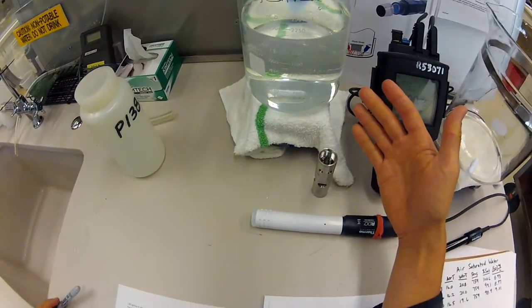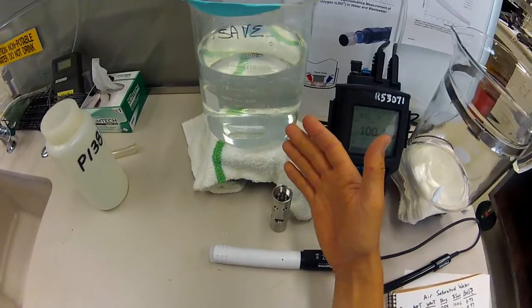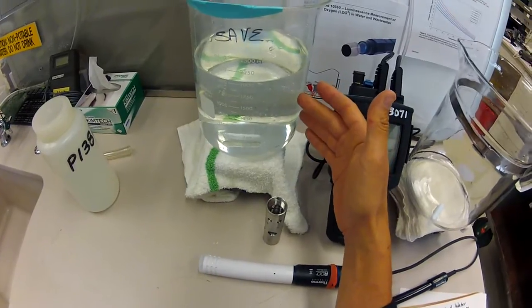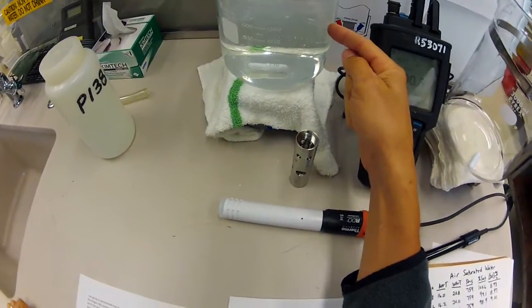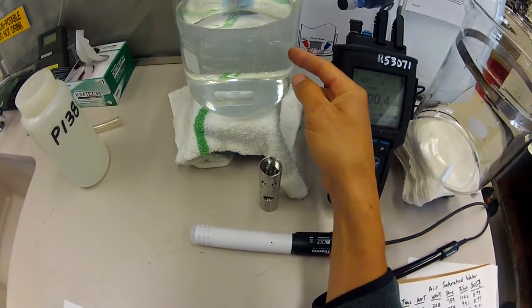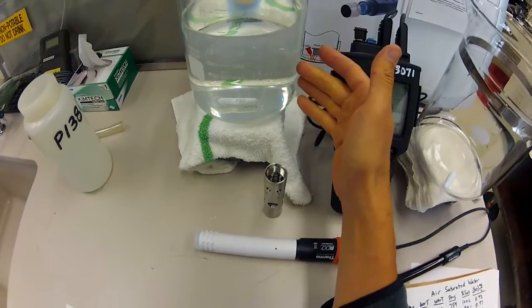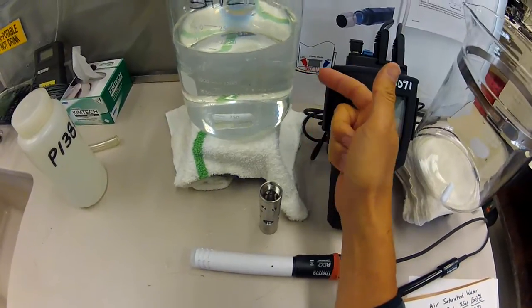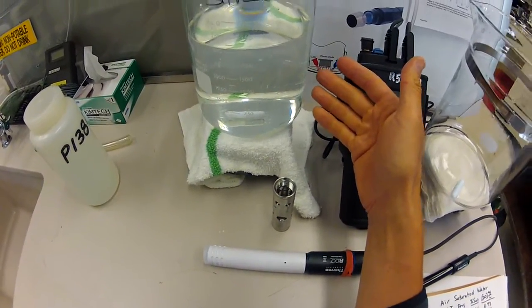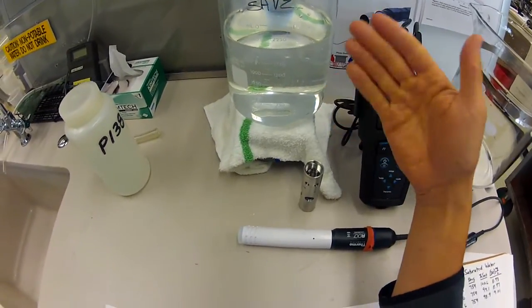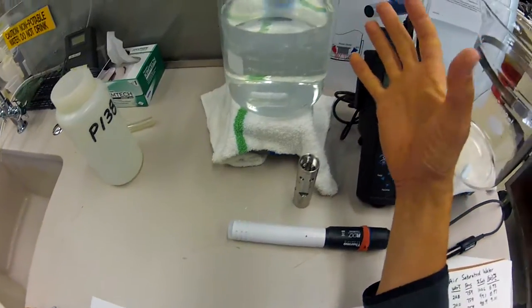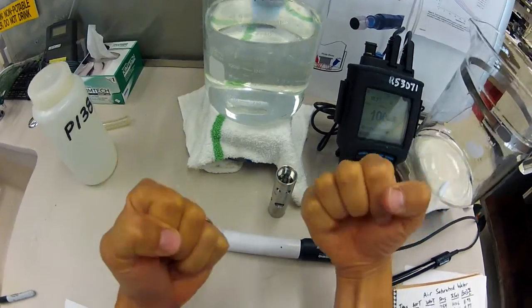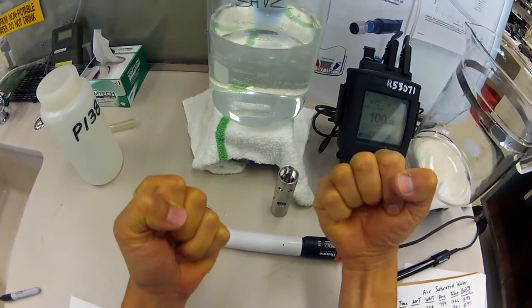The key elements to remember when you're doing this is that if you give this sufficient time under stable conditions, you're going to reach a predictable concentration of oxygen in this water. That's going to be at what we call completely saturated or 100% saturation. Now 100% saturation is going to have a different concentration in milligrams per liter depending on temperature and barometric pressure. Colder water tends to hold more oxygen, so you've got higher concentrations of dissolved oxygen in colder water.